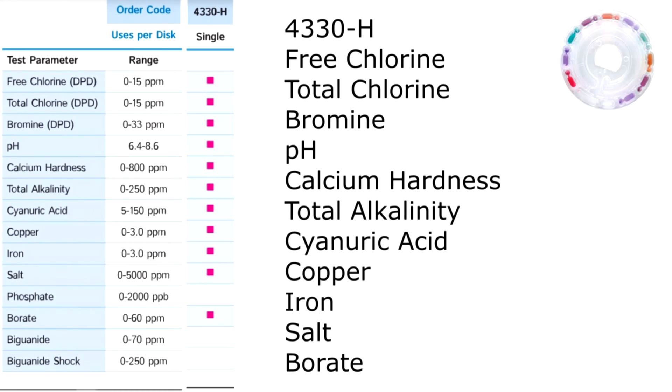The spin disc series 4330-H tests for free chlorine, total chlorine, bromine, pH, calcium hardness, total alkalinity, cyanuric acid, copper, iron, salt, and borate.